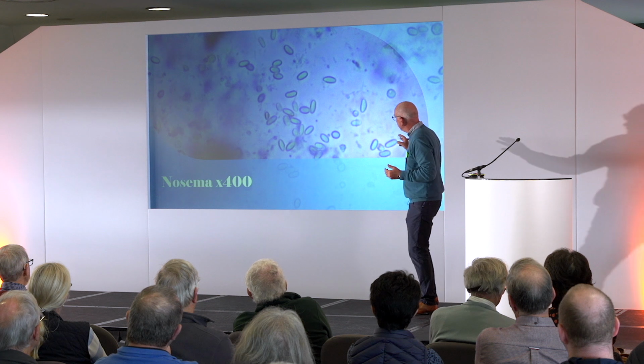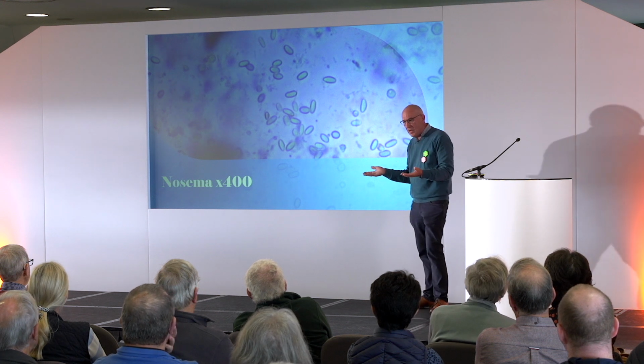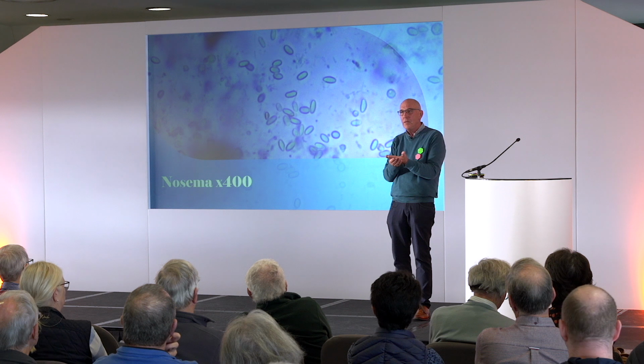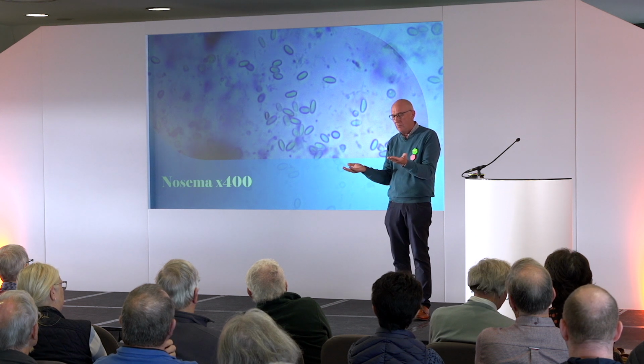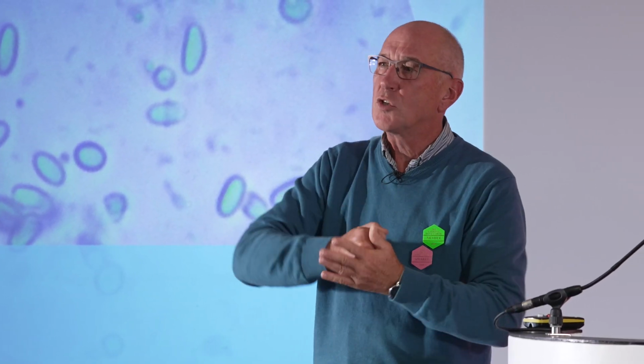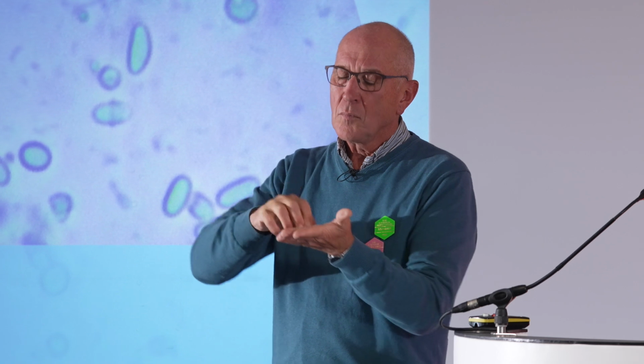So what you do is take a sample of mature bees, foragers, from the outside of the hive. Take 30, and I put them into a plastic bag, the Ziploc bags, and I just squash them. Sorry, I put a little bit of water in as well.